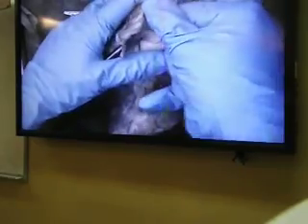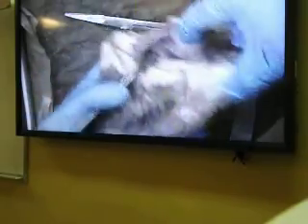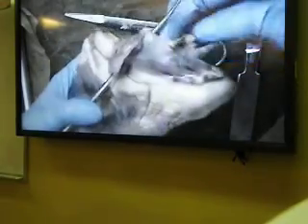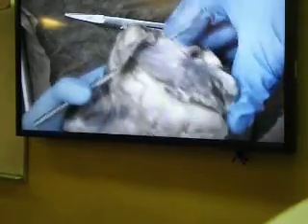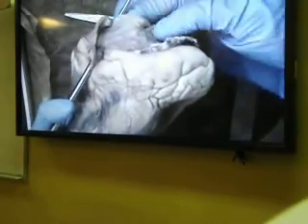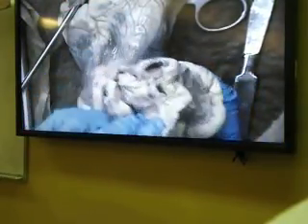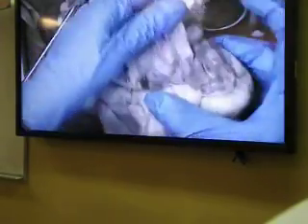I want you to keep the probe, and always, if you have any confusion in the heart lab, go to the chamber and see, is it really correct that that's superior and that's inferior? It has to be, because both of those are ending only in this chamber, and I know this chamber that I am pushing is the right atrium, covered by the right auricle. Now I want to show you another superior and inferior vena cava, which is pretty long, so long that sometimes the inferior vena cava is hard to see.